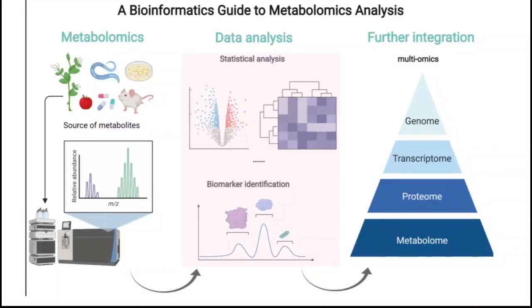Welcome to another video tutorial. In this video, I will explain how we can interpret the results of metabolomic data and will also show you which figures are important from the research article point of view. We will also talk about selection criteria of differential metabolites and recent tools being utilized in metabolomic studies.